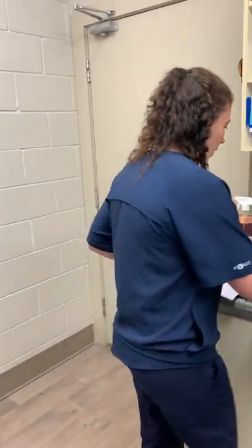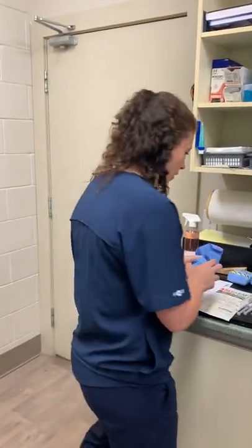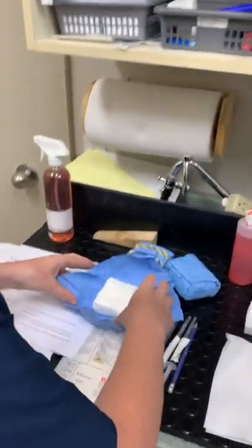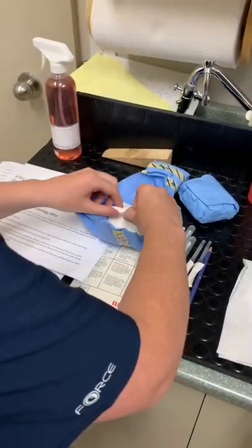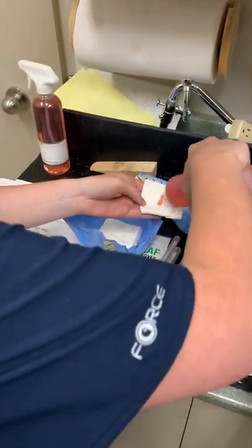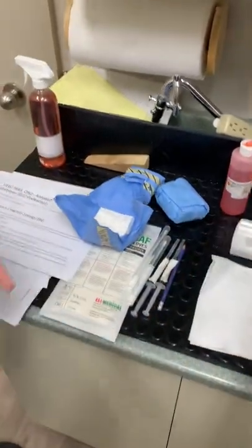I'm going to start by doing a prep. I'm going to take my gauze here. Everything I'm using here is sterile, as indicated for the assignment instructions. I'm going to take some of my gauze here and take this, which is our chlorhexidine 4% antiseptic.